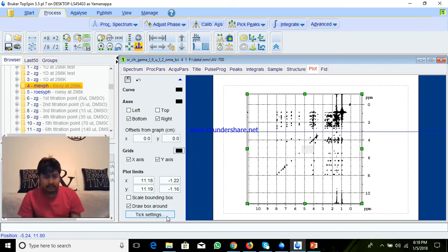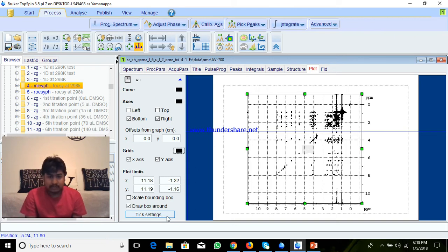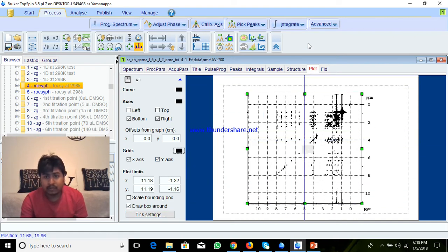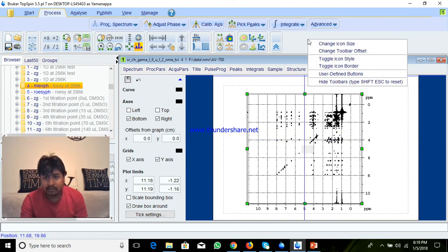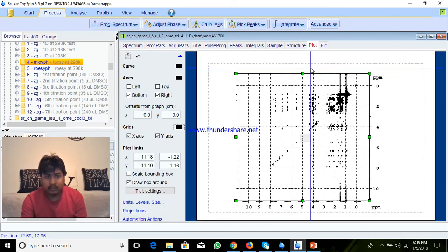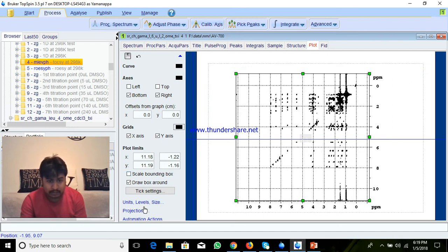Here I am seeing some other options. Now I will go to projections — I will give the top one projection and left another projection. I can also change the thickness and color of these projections. Thickness is changed.